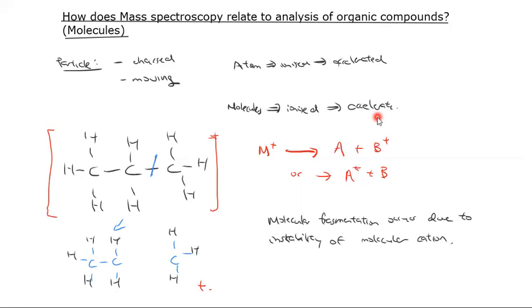All right. So with that understanding, if your molecule breaks up before it gets to the detector, will the detector detect the molecule? No. Will it detect the pieces? The pieces. It will detect the fragments.